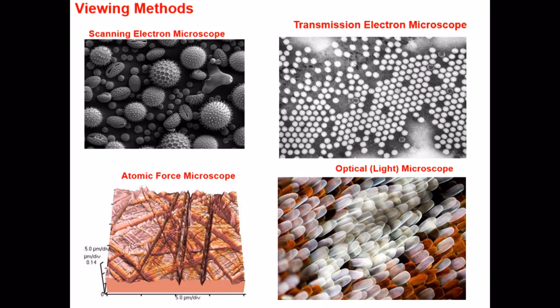So I will show some of the morphology which we got from our own microscopes. This is a scanning electron microscope image of a biological sample. This is silica, SiO2 hollow spheres. This is from a transmission electron microscope, and this is twinning in a material. When a crystal grows, the atoms try to arrange periodically, and if there are defects, one of the defects is twinning. One atom going above or below breaks the periodicity. It is a defect. These defects you can analyze using atomic force microscopy.